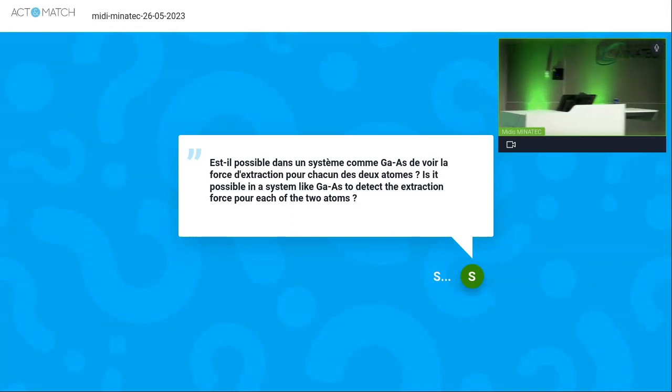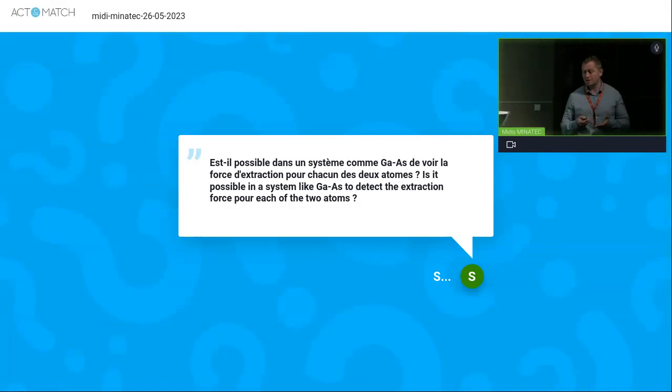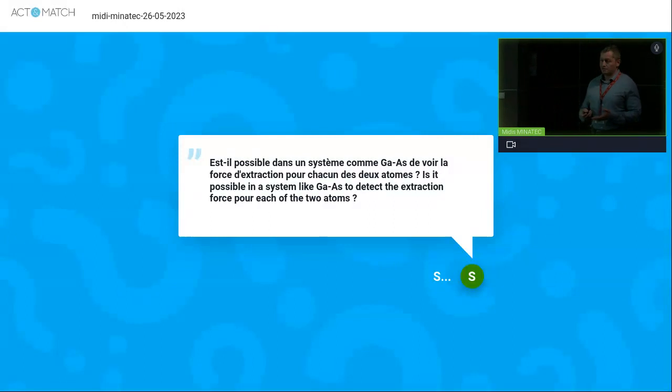The contact resistance, this is spreading resistance. So you must take this into account, but you don't normally know your contact resistance, because there are many factors which will influence it. You can have, for example, even some oxides.